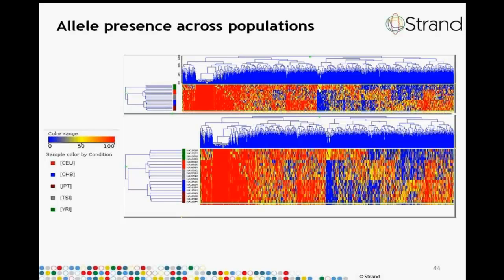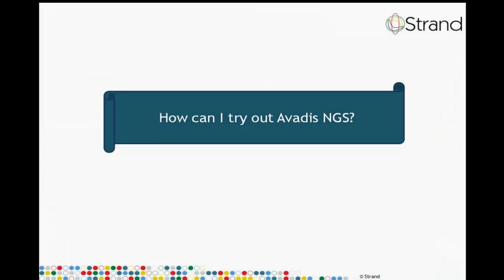Similarly, if you are interested in those alleles which are absent in most of the populations, but they seem to be present in the European population, one could save this subtree. That concludes the technical details of our webinar.